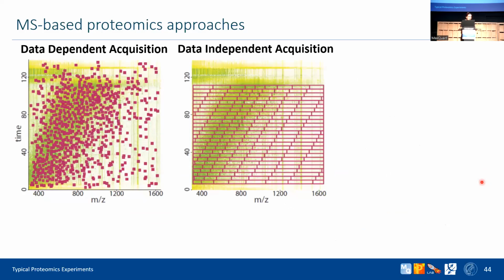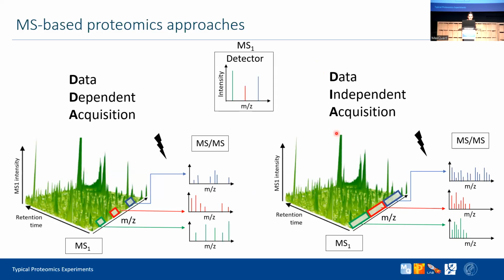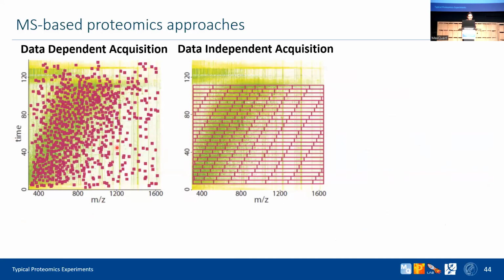This is a different way to see what I already explained. Before, you saw this 3D plot, the green landscape. Now, let's pretend that we are watching this plot from above. Let's pretend that this red stuff doesn't exist. The green stuff under the red stuff is what we saw before. So now it's the 3D plot in a 2D-like view.